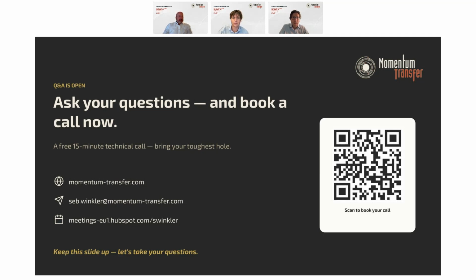Yeah. Thank you for the thorough explanation on how synchrotron measurements help to identify trace amounts of mineral phases. XRPD is indeed a very strong technique to evaluate multi-phase mixtures. Having worked previously on mechanosynthesized tetrasulfides, I saw the importance of XRD. So that's not a question. Thank you, Mike. But that's quite right, Michael. Yeah.